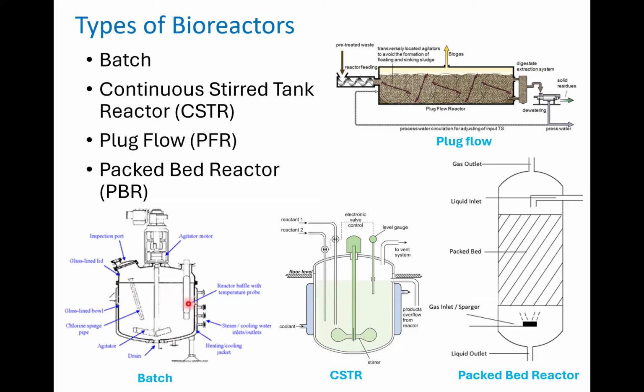Decant means that you have to empty the system and maybe leave some inoculum at the end for a new batch. Or if you put in enzymes, you need to empty and start over again, or you can leave some material as inoculation for the next batch. So this is a very simple system, and it can be used for small scale, sometimes also for larger scale, depending on the materials that you are dealing with.